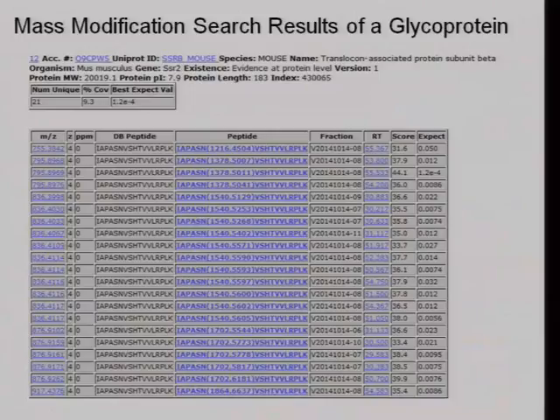Which kind of ionization is used to study glycopeptides, MALDI or electrospray ionization? Most data is electrospray. The big advantage of electrospray is that you can interface it with chromatography. So you can have a complex mixture and separate the things, and as they elute, you can analyze them.